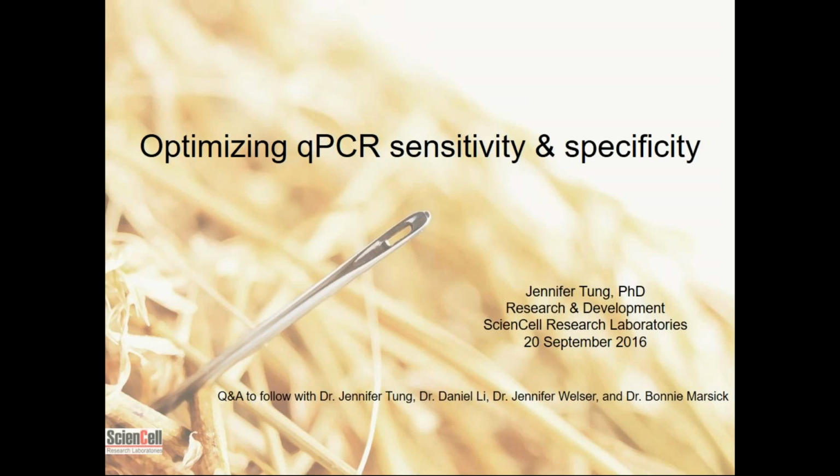We'll finish with a brief introduction to our GeneQuery qPCR array products and end with an example of how qPCR data can be used to confirm, augment, or inspire future studies.